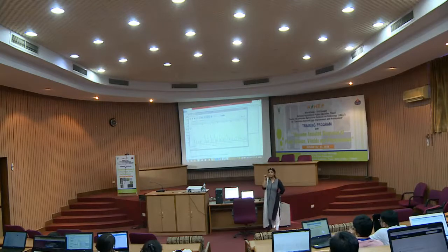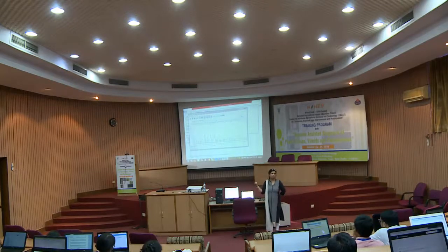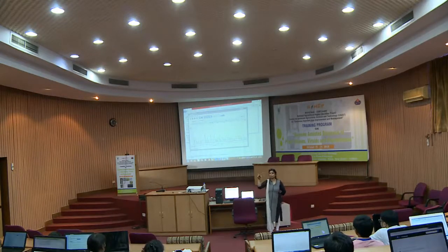So this is a very tricky thing, and you have to actually spend a lot of time doing such analysis. So always generate a good PCR amplicon, your primer should be free from any degradation, the company should provide you clear-cut peaks, it should not be something messy, with some other peaks coming below.